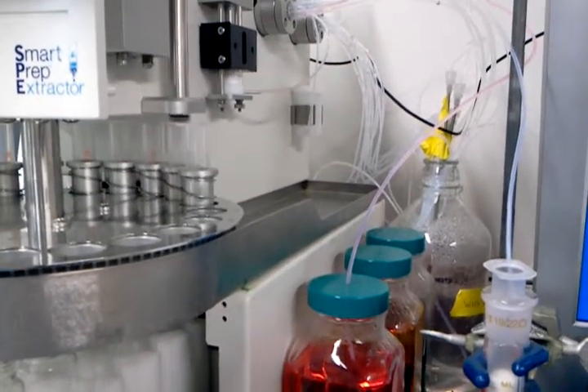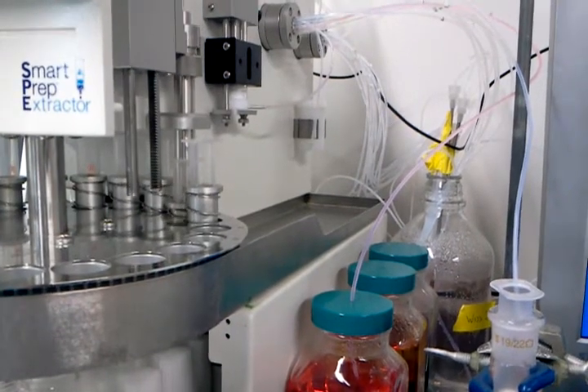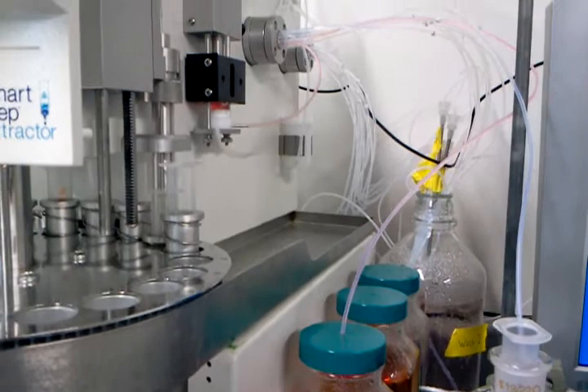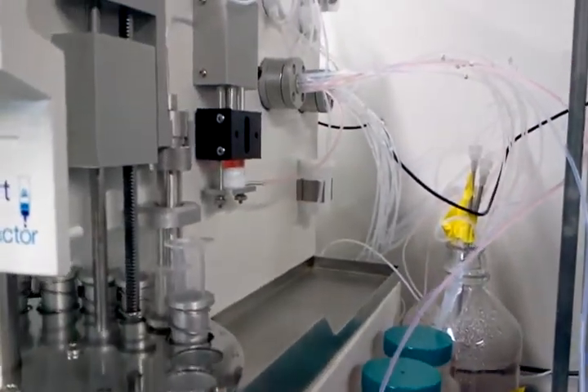For this demonstration we're using a smart prep to pull one mil of sample and deliver it to the head of the SPE column. Right now what the unit is doing is pulling this orange colored water which represents methanol.